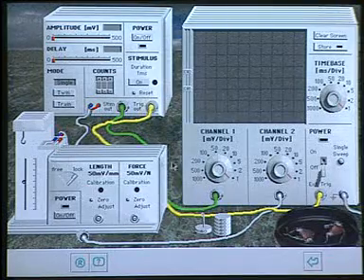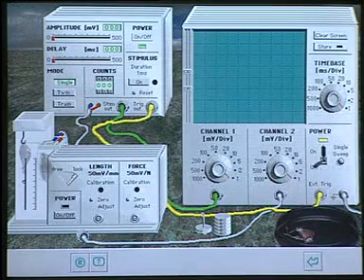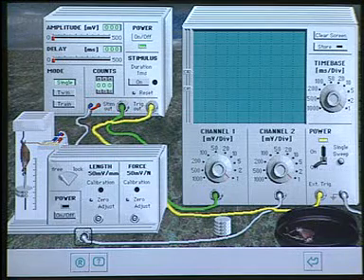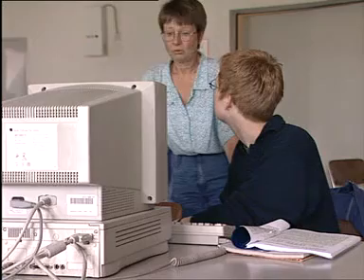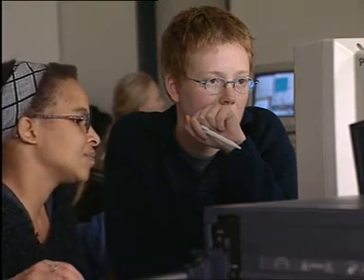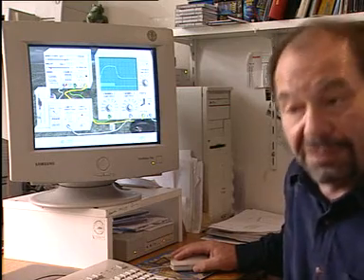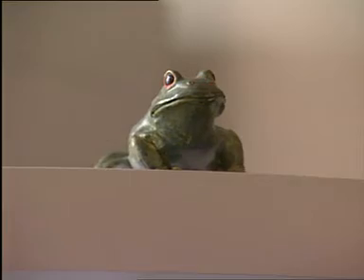You have all the devices you need to do the experiments. You switch on the devices and adjust the parameters. You can apply single pulses or double pulses to see the superposition of two contractions, and you can apply trains of pulses to analyze tetanic contractions and so on. There is plasticity in each isolated muscle. We didn't consider this plasticity here — it only occurs in the artificial situation of an isolated preparation, not in the physiological situation. This disturbs the recording sometimes very seriously.